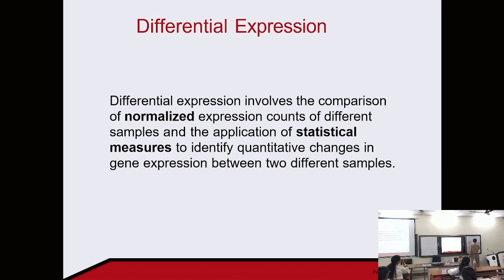Let's say that the metric follows this distribution, and you want to find whether a value is significant or not. Upregulation would be towards the right, a high value. You compute the p value for that, and the p value is basically this area.